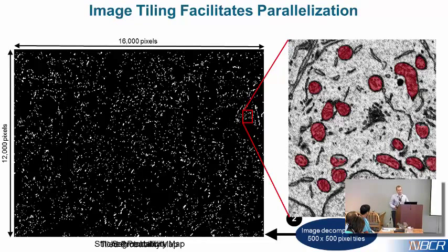So it depends on a couple of factors, of course. One is how large is the data set. So if you load, depending on the power of the machine you have, a 32K by 24K image and try to segment it, it might be slow. So a lot of times I'll do the segmentation on a downsampled version just because it's faster for my machine. Obviously, you can only do that to the extent of which you can still determine what the structures are. If you downsample too much and you can't tell that it's a mitochondrion, obviously that's a problem. And if you can't tell it's a mitochondrion, there's no way the machine's going to be able to. So basically, yeah, the segmentation can be done on really any resolution you want, and then you can determine your strategy from there. Does that make sense?